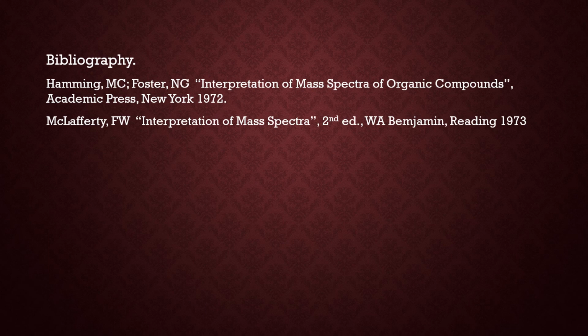The bibliography regarding the interpretation and the application of the adding rules that I've just applied can be found in any introductory textbook on interpreting mass spectra. These two happen to be very good.